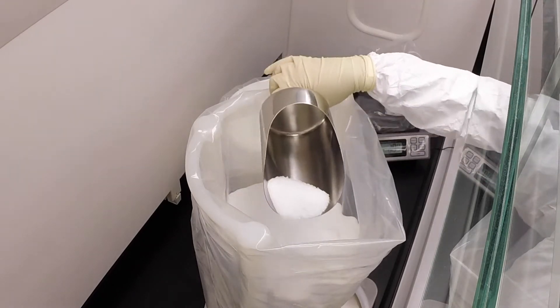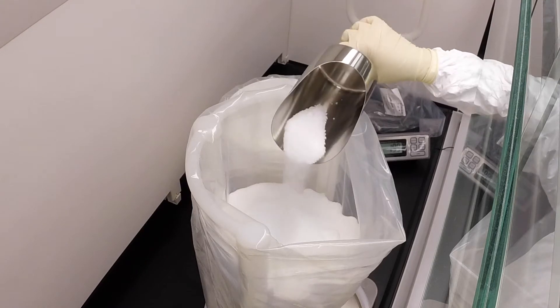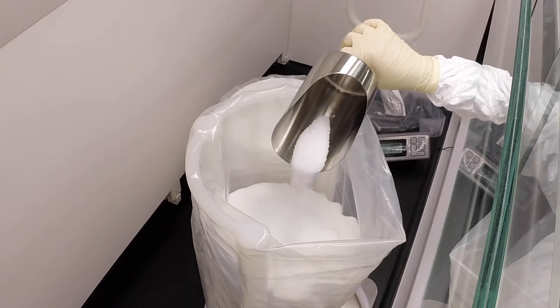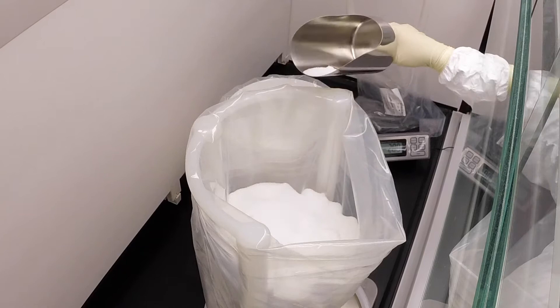Our three-dimensional EZ-Biopac bags feature a large, round opening that makes them easy to fill and easy for operators to fine-tune to exact weight.